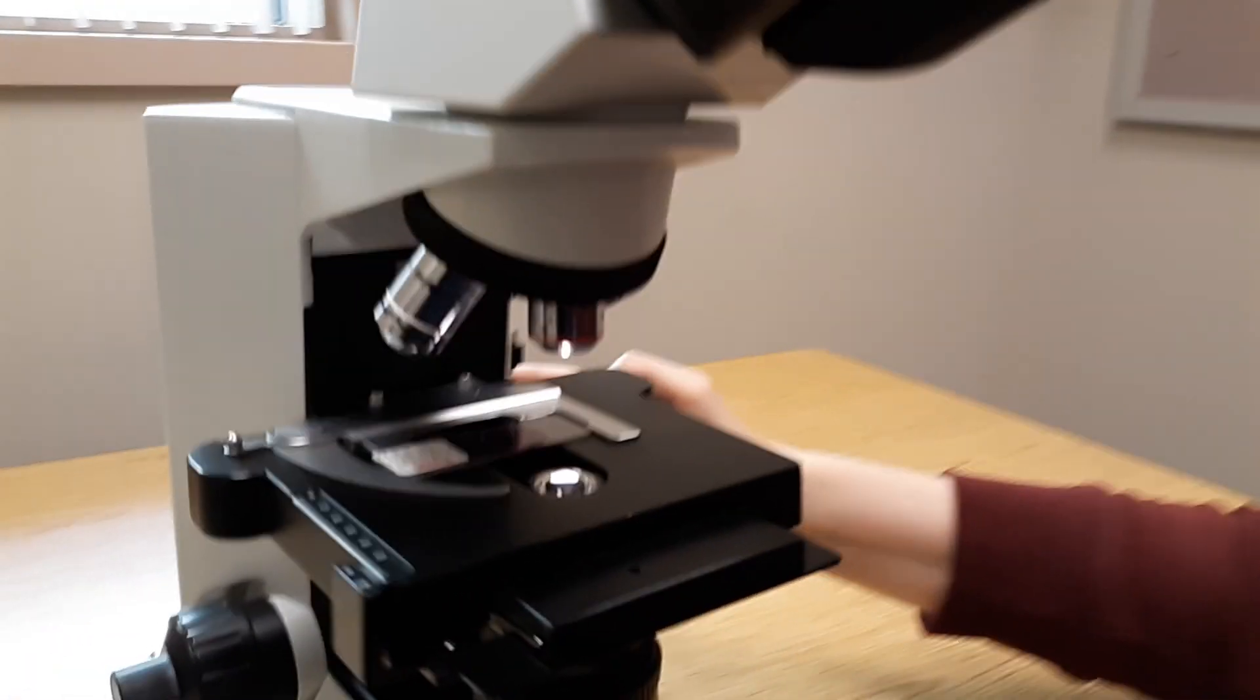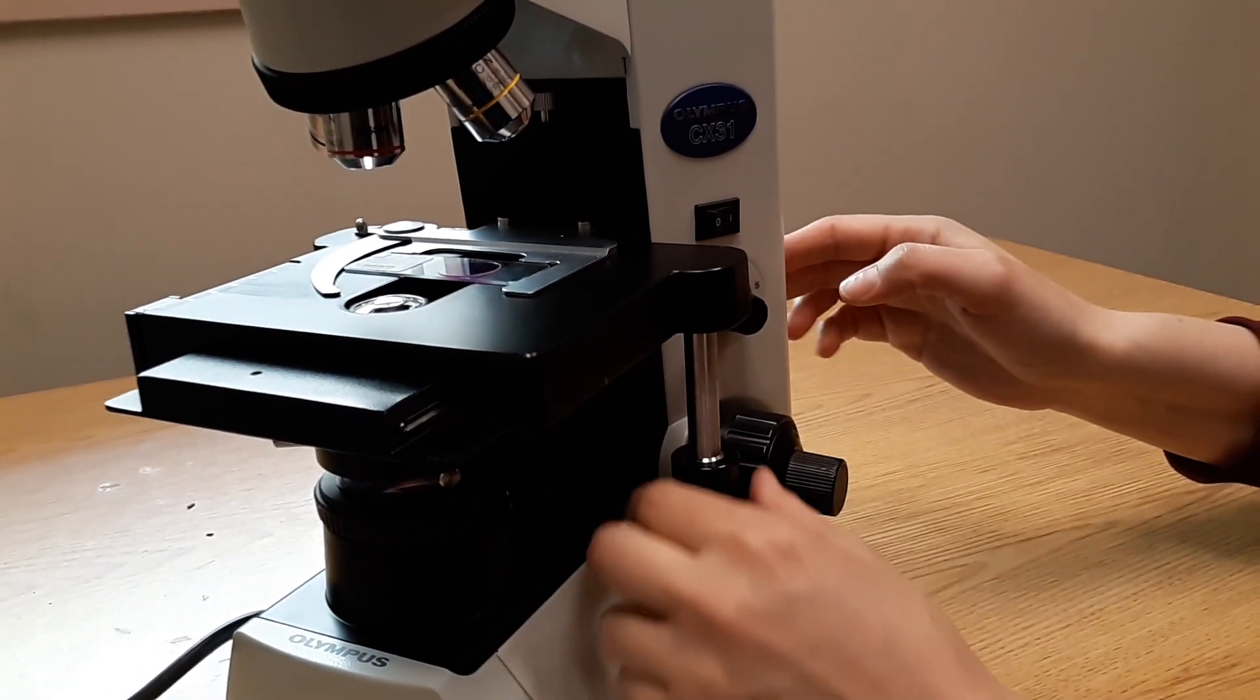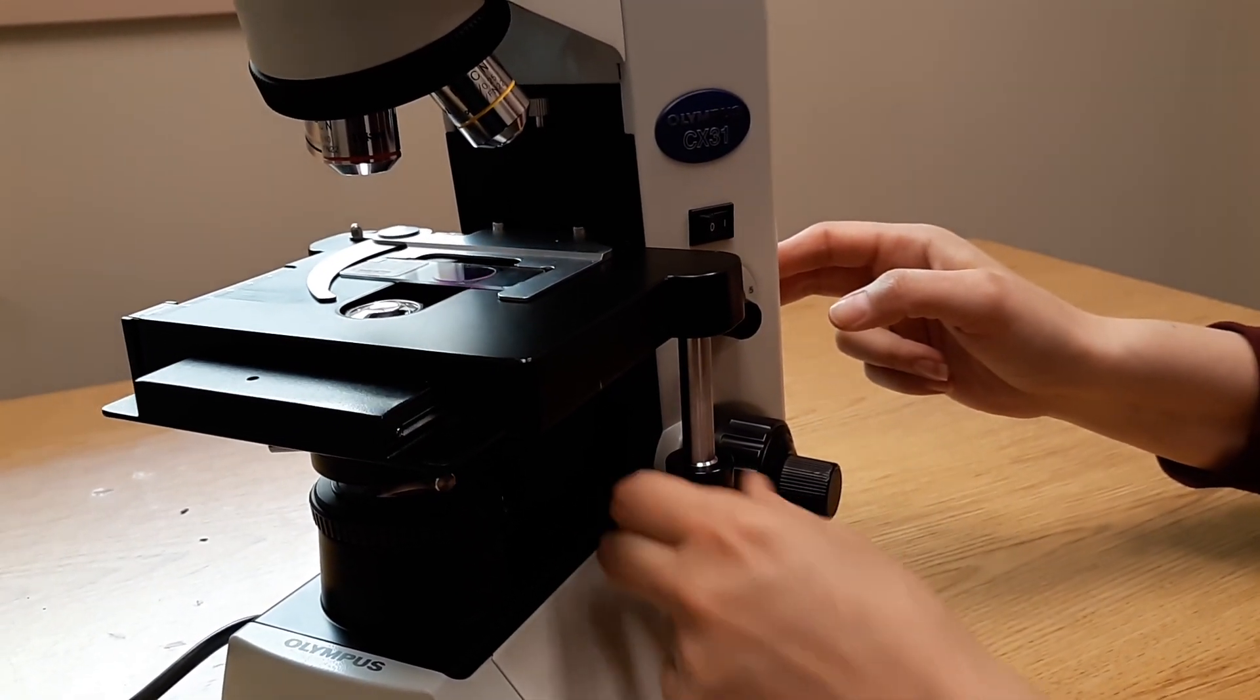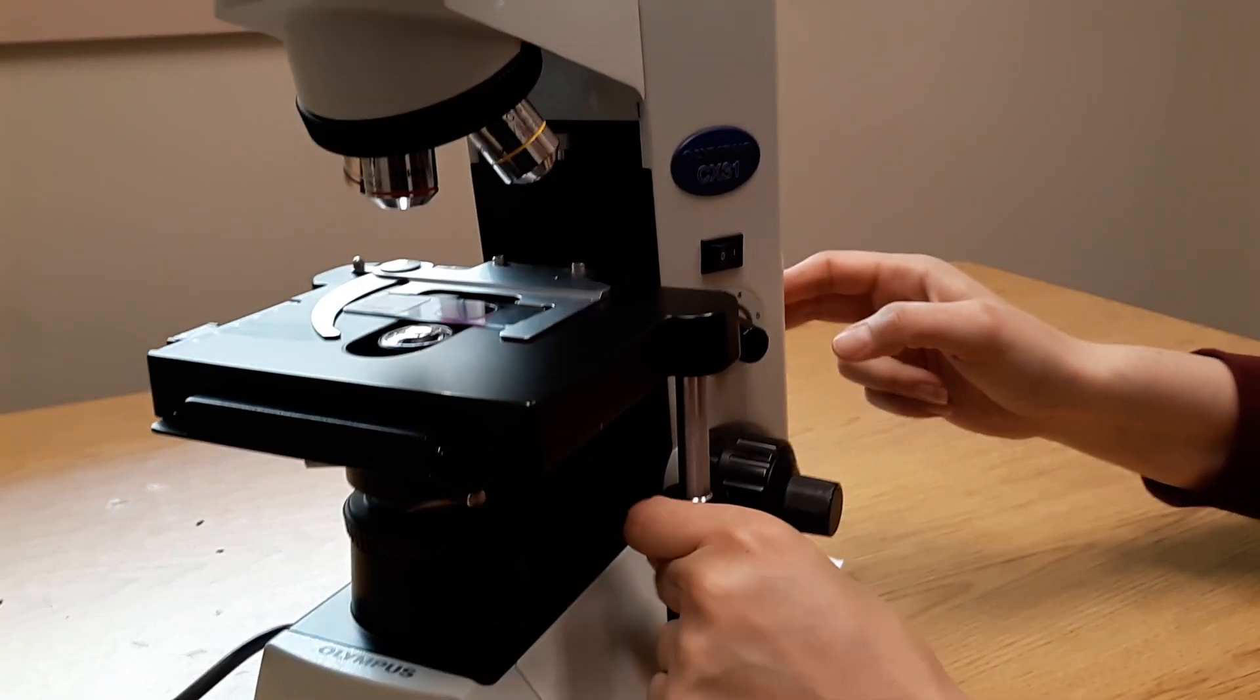On the side of the microscope, I'm going to rotate it for you. You're going to have these two knobs. The top one moves it forward and back, while the bottom one moves it left and right.